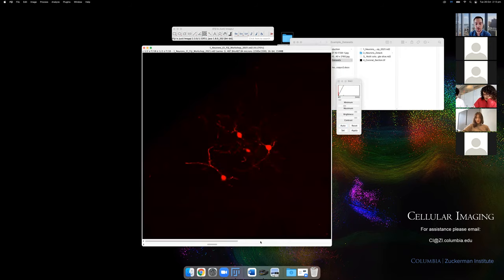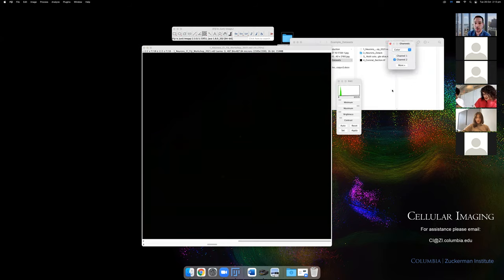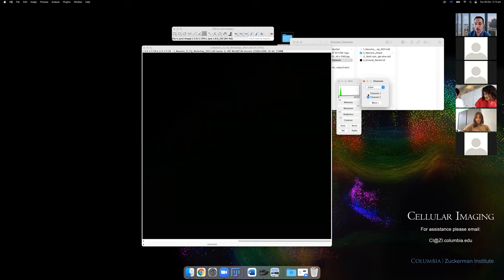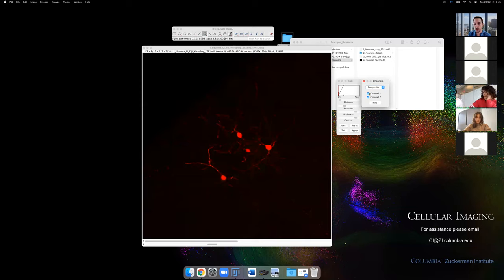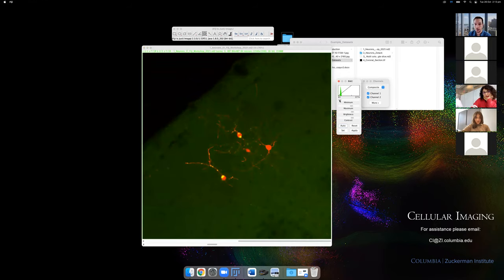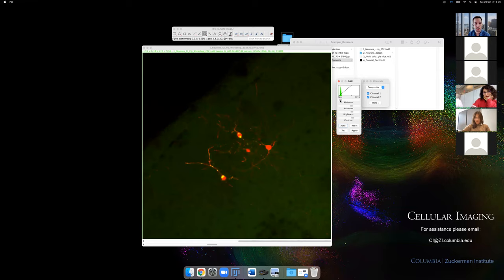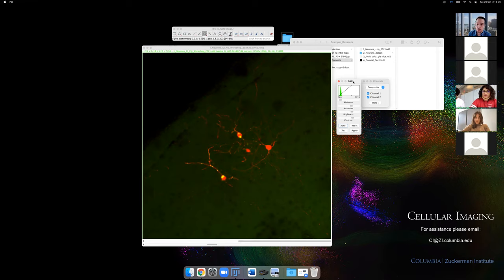If you have multiple channels but can't look at them together, press Cmd+Shift+C (or Ctrl+Shift+C on PC) to bring up the Channels tool. You can switch between channels or, more usefully, switch to Composite mode so you can look at channels together. With a four-color image you can check any combination of channels to view them together, in part, or completely together.